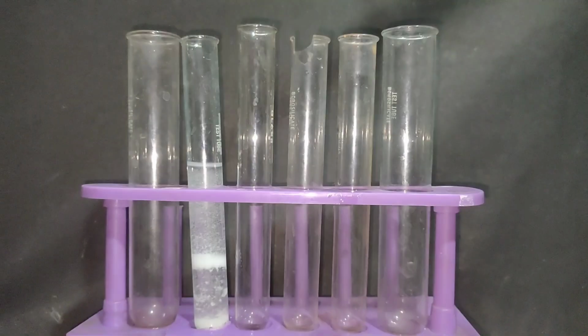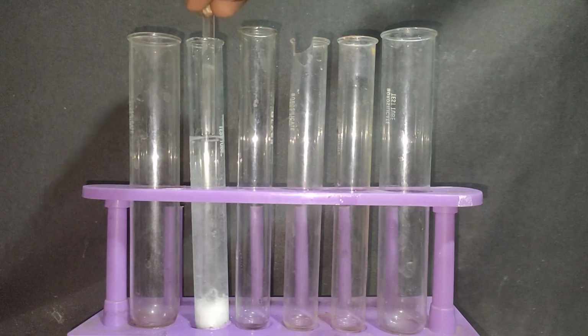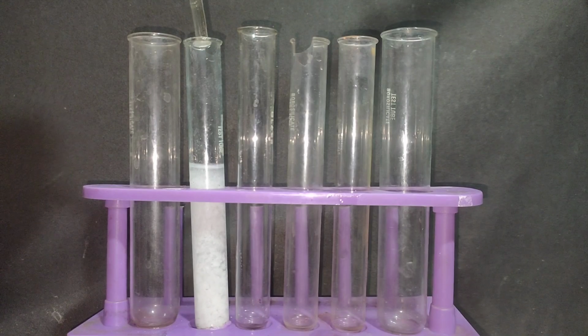Now, at this point, you don't have to stop adding dilute hydrochloric acid. You have to add hydrochloric acid until all the precipitation is over. So I'll be stirring this with my glass rod. A white precipitate indicates the presence of group 1. What are the cations of group 1? It is lead 2 plus, silver plus and mercury plus.